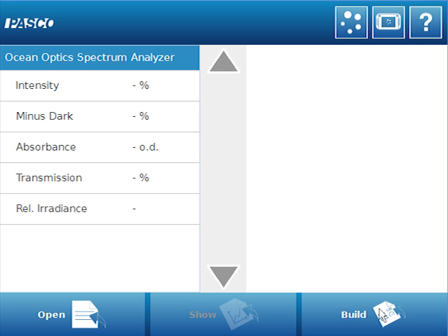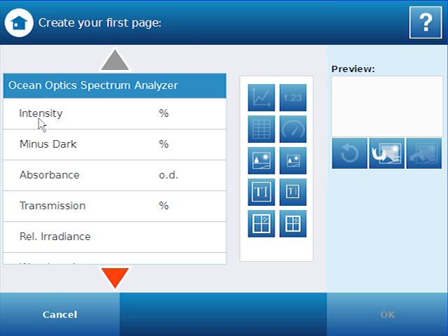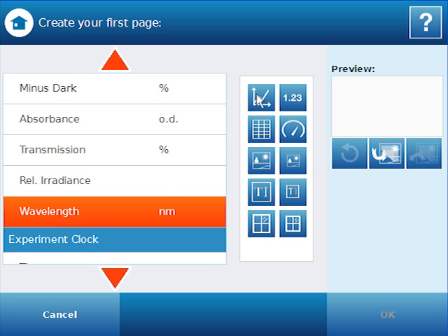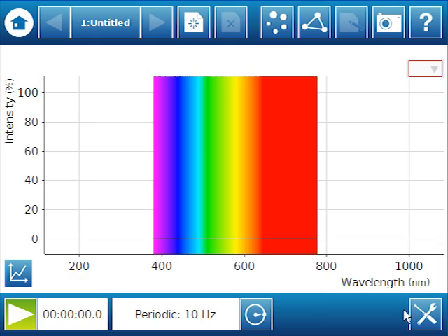And specifically, right now, we are going to build a graph so that we can look at intensity versus wavelengths. So we're going to hit our build button. And I'm actually going to build two graphs, and I'll show you the reason why I'm doing two in a second. I'm going to do intensity versus wavelengths, and we'll make that a graph. And we get a nice xy-axis graph of intensity versus wavelength. And we even get this nice background to give students a visual cue about what the wavelength means in terms of the visible spectrum.